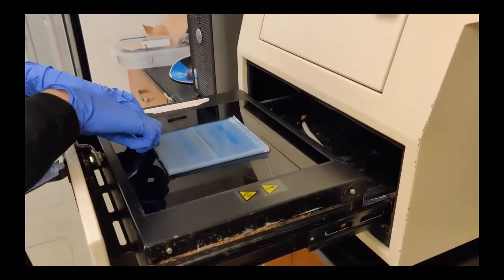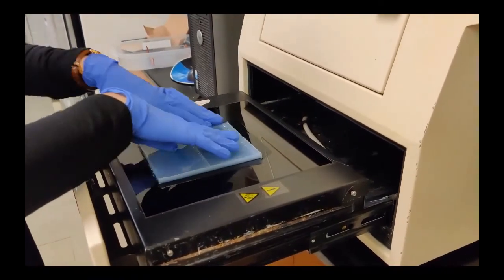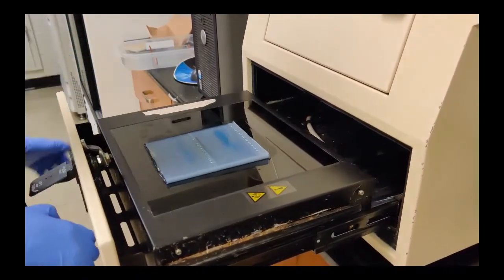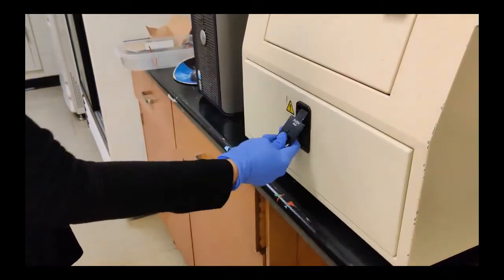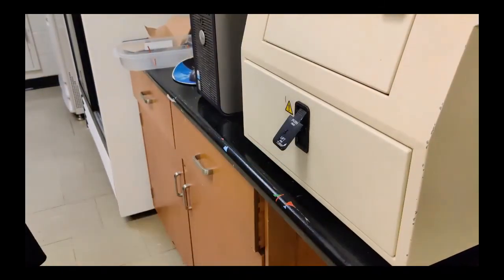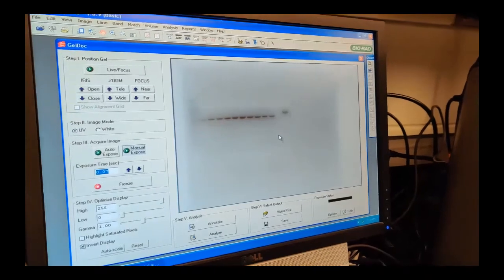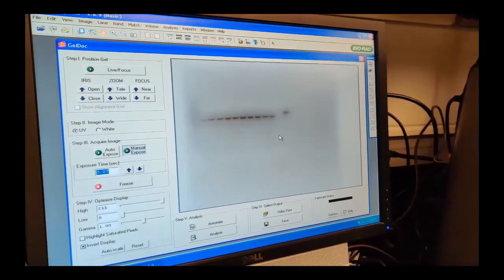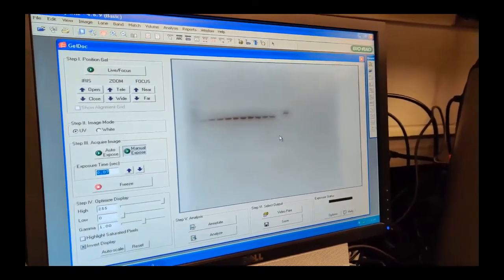First, put your gel into the machine. Now just turn on the light and we can see our DNA bands.